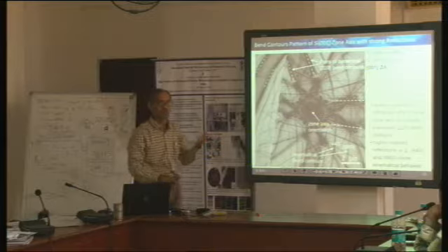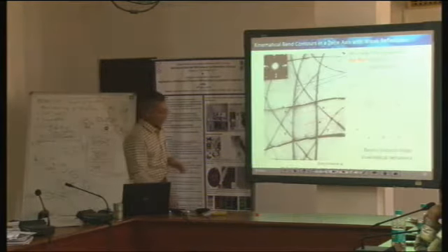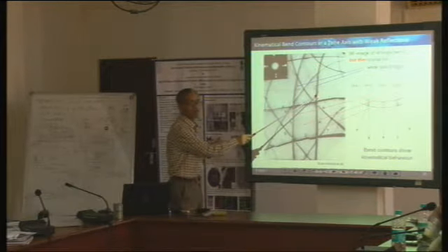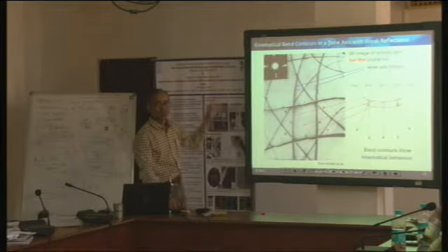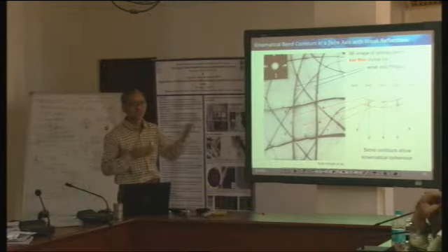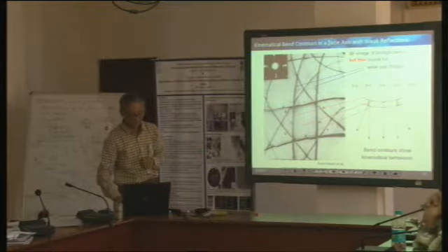It need not even be that where earlier there was a dark maxima, or let's say dark valley, we saw in the dynamical effects that this need not hold if the sample is very thick. There might be a bright maxima also. So it's difficult to interpret.